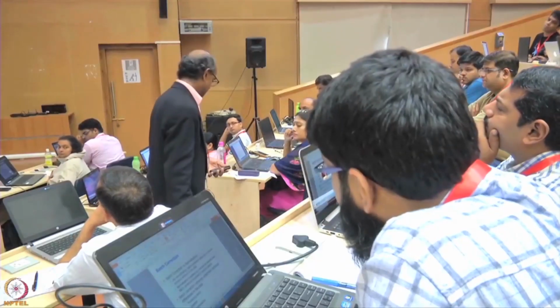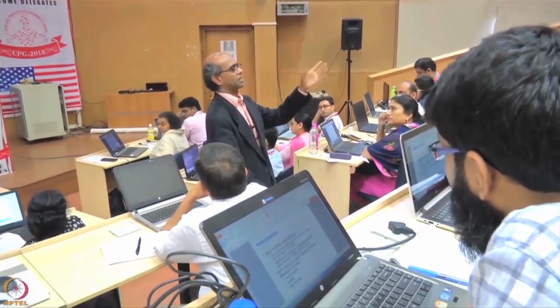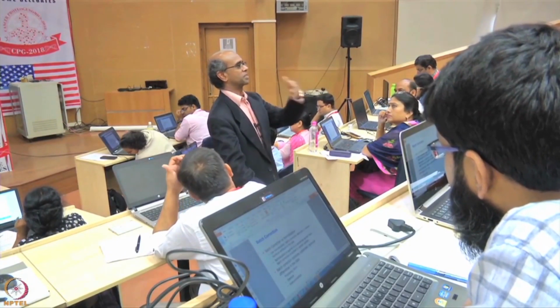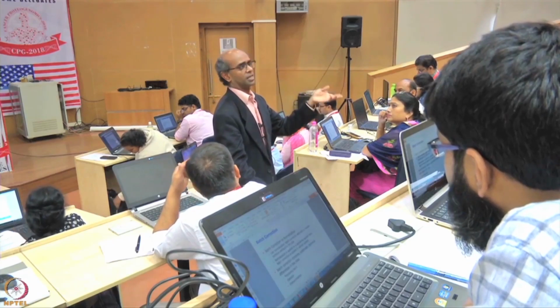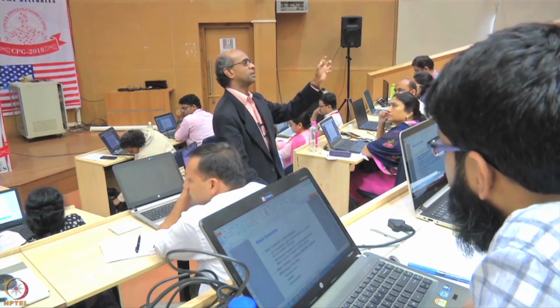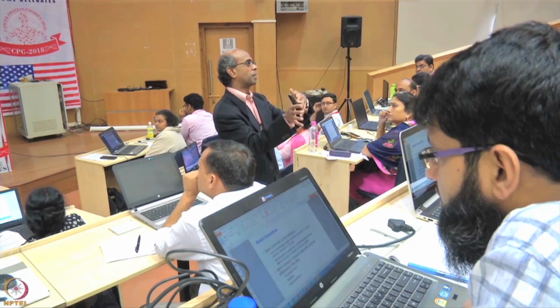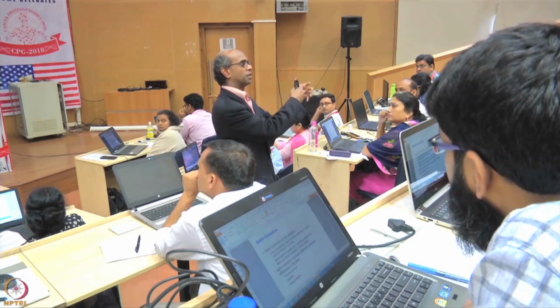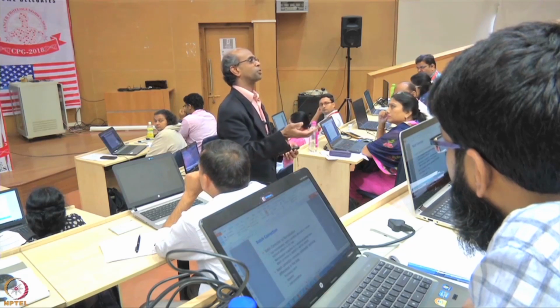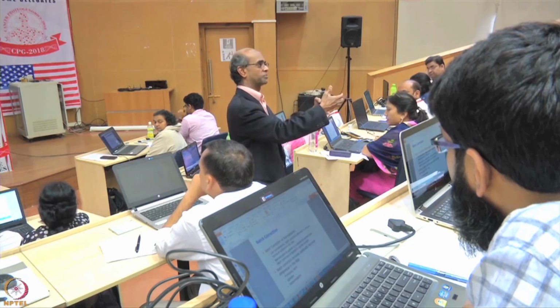If the question is whether a protein was different between type A and type B, so like cancer versus normal, a protein is different, you do it 3 times and you see the same difference. So in that case, you probably don't need batch correction because all you're doing is ratios of cancer to normal in the same batch. But if you have 3 replicates, your statistics will be much more robust. So you can combine all the 3 replicates to find out which proteins are different.